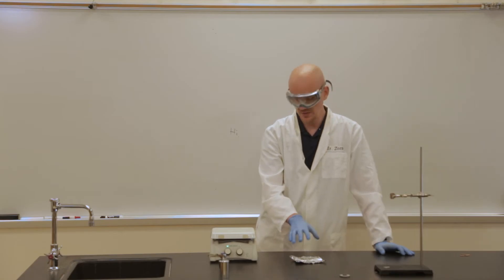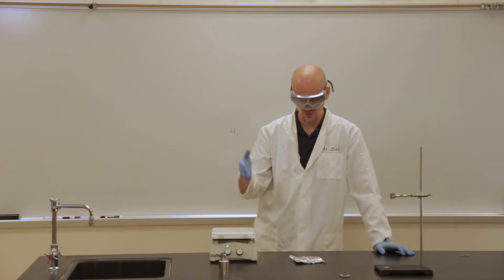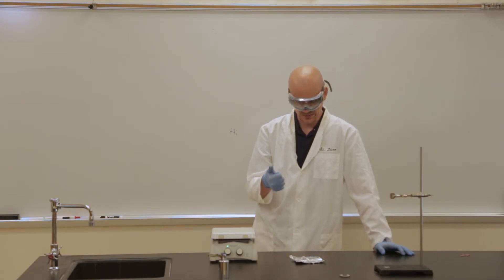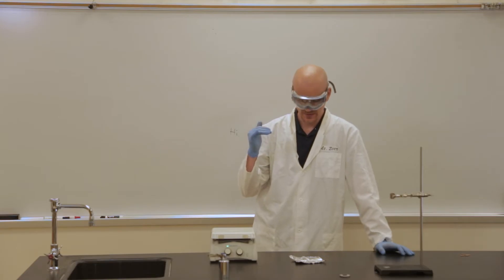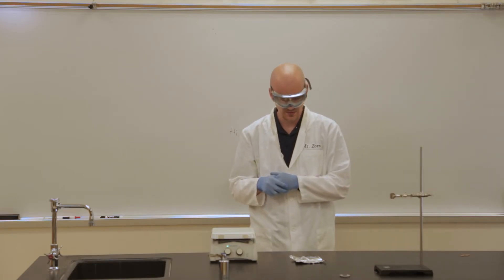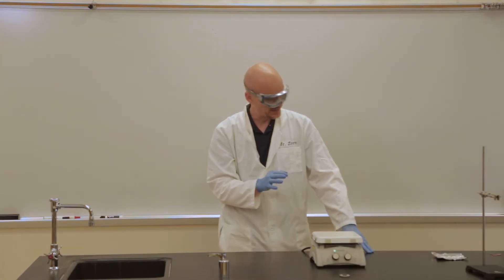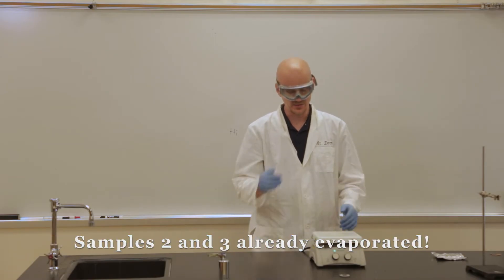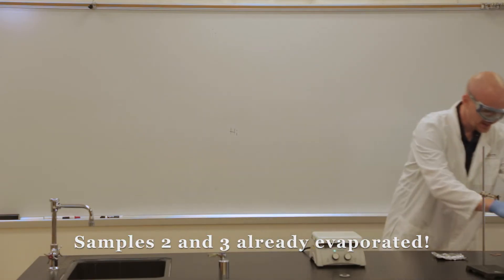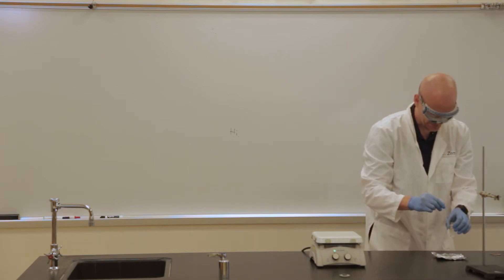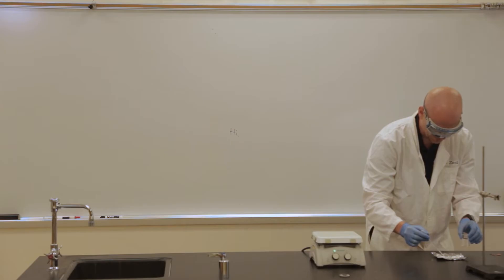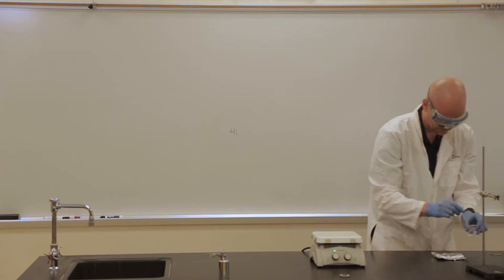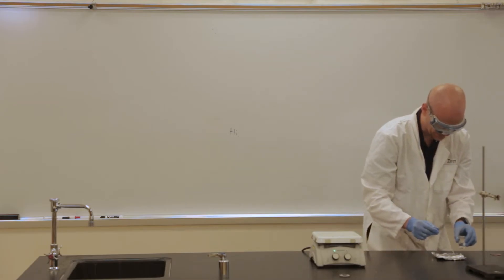I'm going to take this aluminum boat, stick it on the hot plate, and we are going to watch the order that these evaporate in. We're going to find the one that evaporates the quickest and the one that takes the longest, and rank them according to their evaporation rates. As I was getting set up, I noticed that number two and number three have already evaporated before I've even put them on the hot plate, so I'm going to add a couple more drops of each. I still have drops of one and four on my foil.